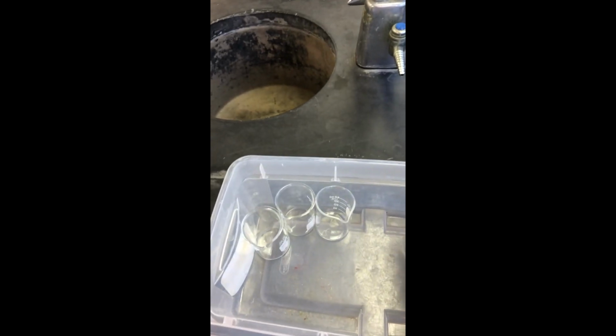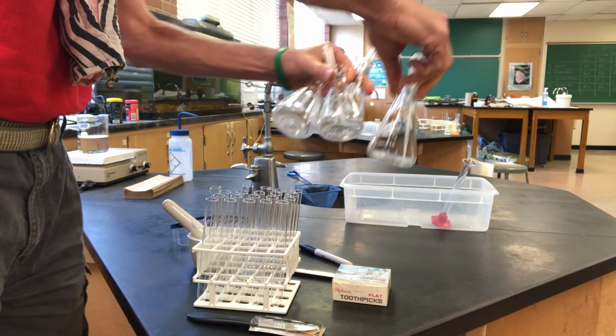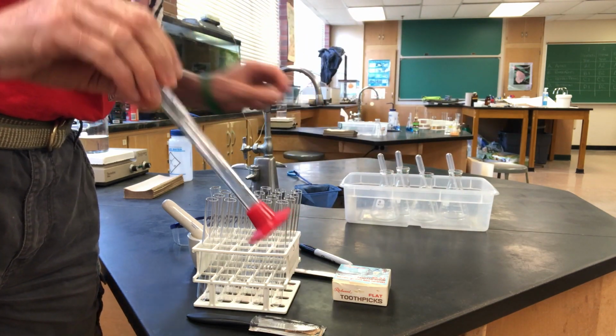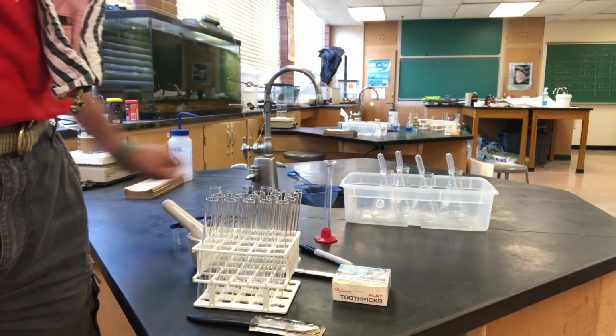The glassware includes a 150 milliliter beaker, 4 125 milliliter Erlenmeyer flasks, and a 10 milliliter graduated cylinder.